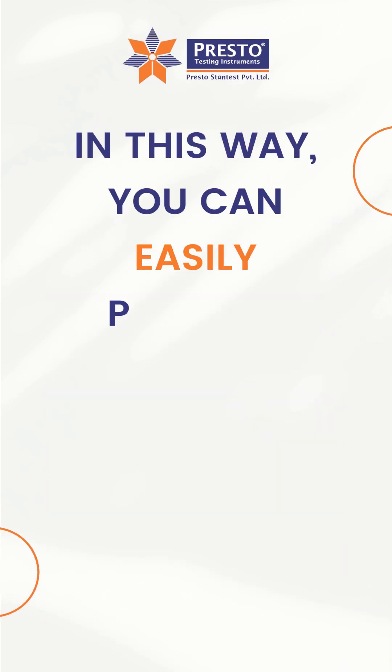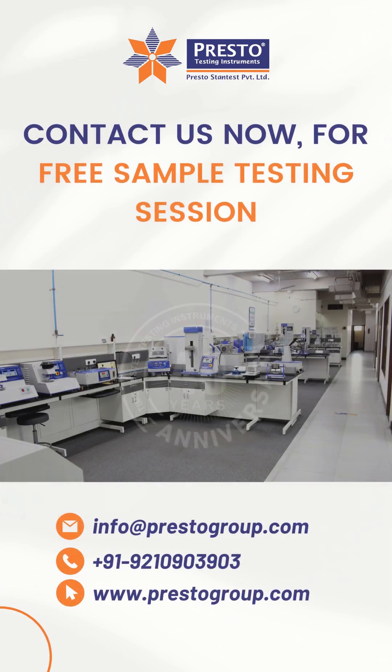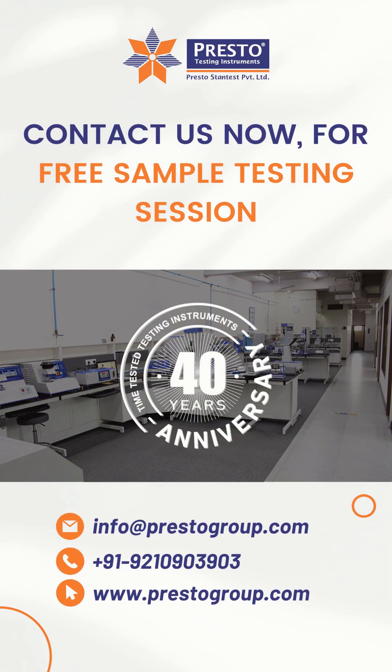In this way, you can easily perform tensile strength testing on BOPP packaging films. Contact us now for a free sample testing session.